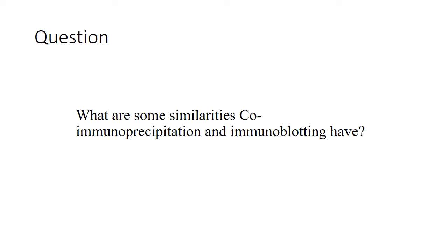My question is, what are some similarities that co-immunoprecipitation and immunoblotting have?